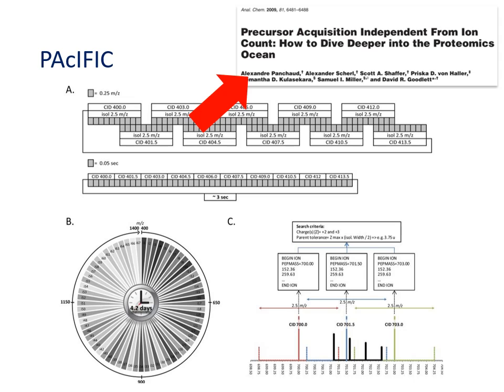I've added a link to the PAcIFIC paper here at the top, so my recommendation is read this for yourselves to make sure you understand exactly how the process works.